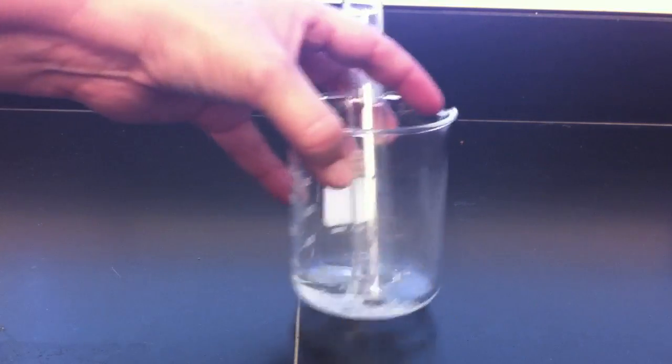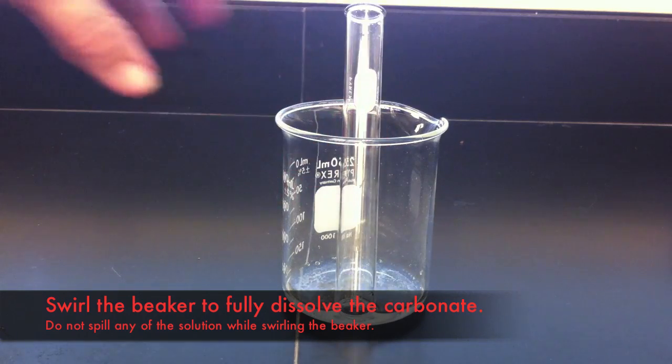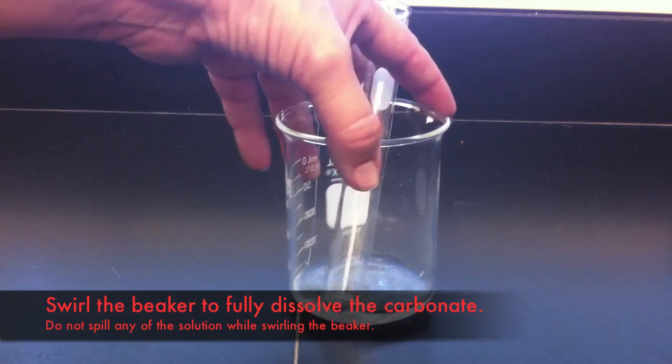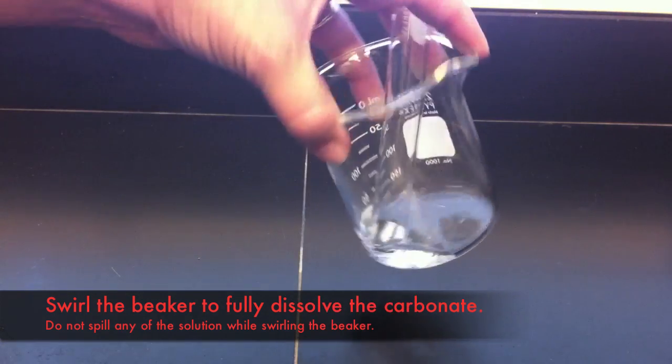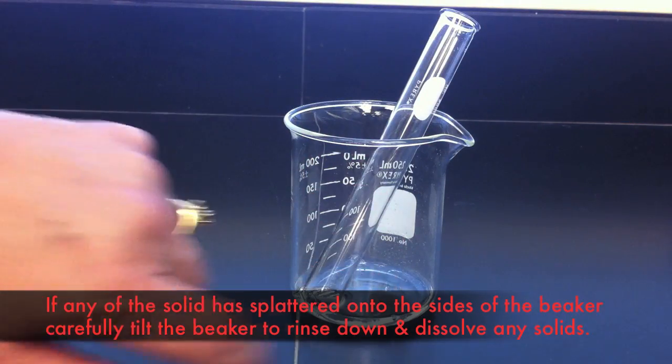Be sure that all the metal carbonate has reacted and that all the carbon dioxide has been driven out of the solution. Swirl the beaker gently. If you notice that there is any of the solid on the walls of the beaker, tilt it carefully and rinse down the solid. Make sure it gets dissolved by the acid.